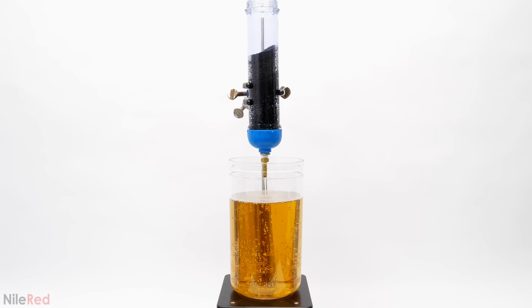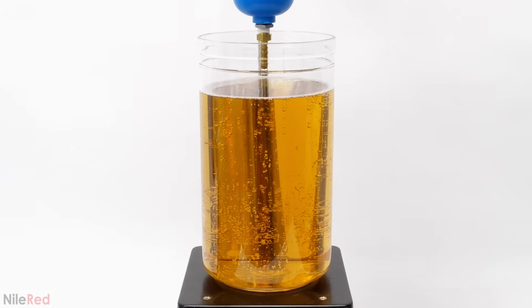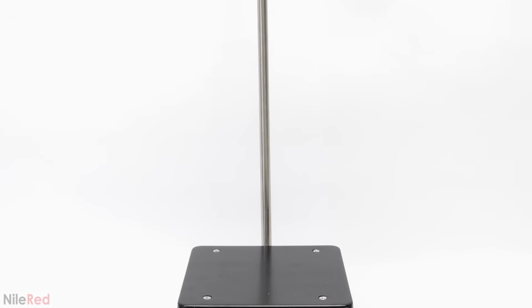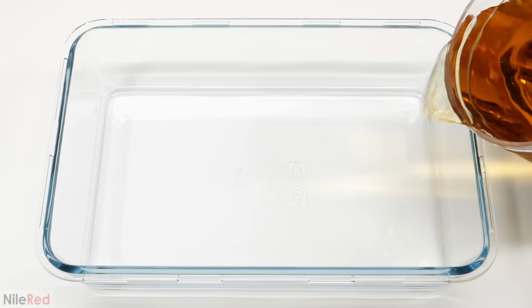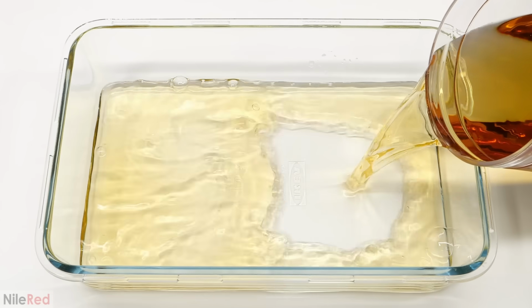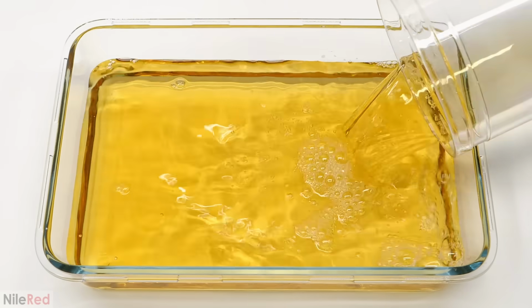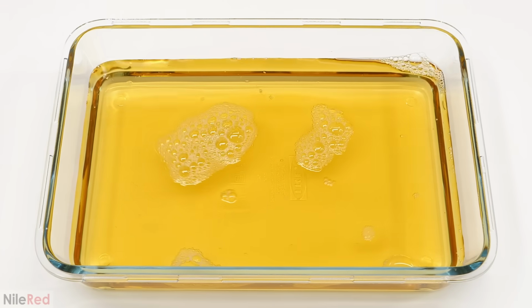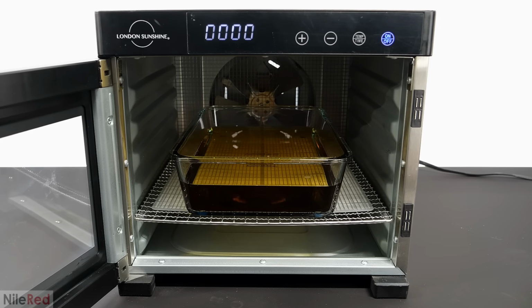When it was done, I washed the resin with some extra water, and at this point, it should have been relatively pure. Besides the obvious orange color, there should have been practically no salts or acid. However, the main issue now was that there was still way too much water, and I had to get rid of most of it. So, after pouring it all into this large dish, I threw it into a food dehydrator.